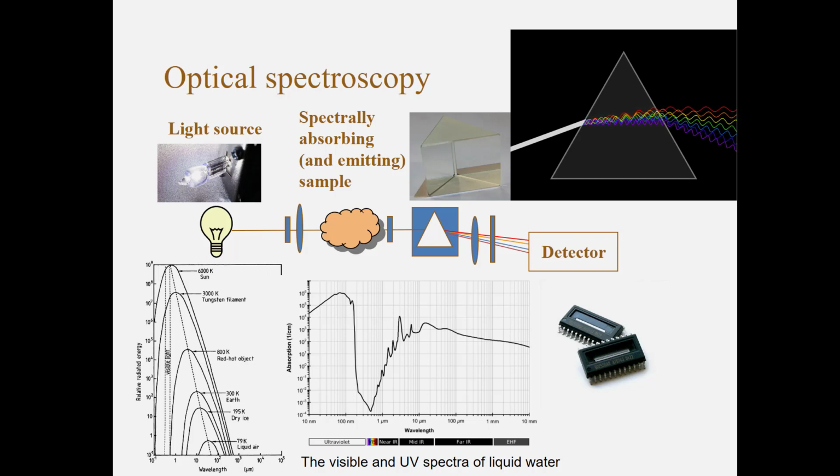So let's start looking at some different light sources. But before we leave this page, let's just quickly look at the blackbody radiation and make the following observation. If we want to do spectroscopy in the visible range, or close to the low IR range, which is where a lot of spectroscopy is done, you see that we need a fairly warm light source.